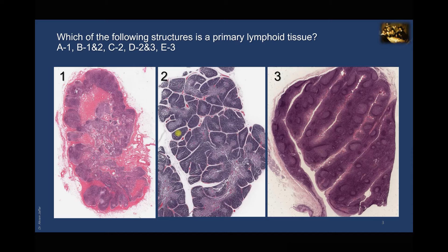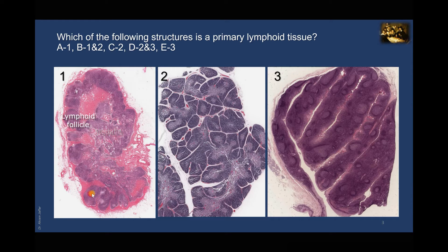A secondary lymphatic organ, on the other hand, is the site where most immune responses occur. Secondary lymphatic organs can be encapsulated, like lymph nodes, one of which is shown here in image one. Look at the capsule of dense irregular connective tissue, the bean shape of the lymph node, the presence of a cortex and a medulla, and above all, the presence of lymphatic nodules in the cortex. So image one is a lymph node — a secondary lymphatic organ where lymphocytes multiply but have already reached maturity.